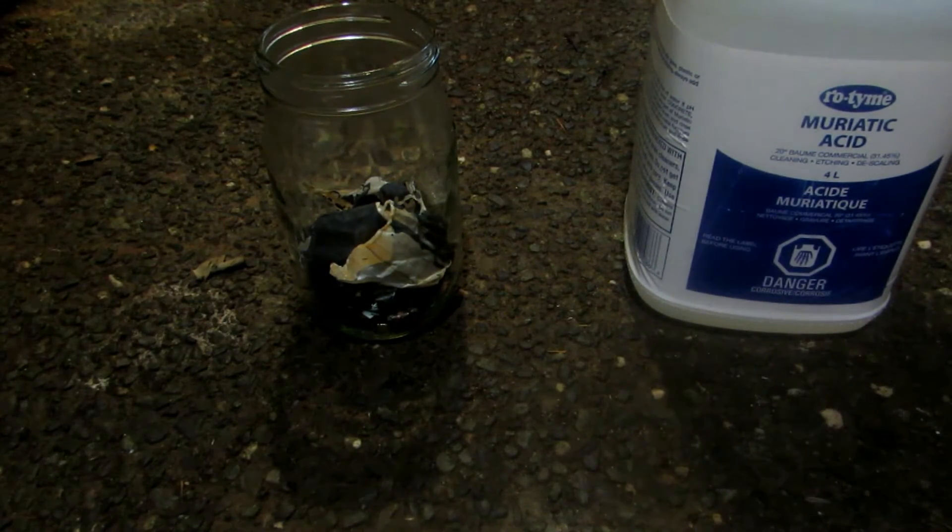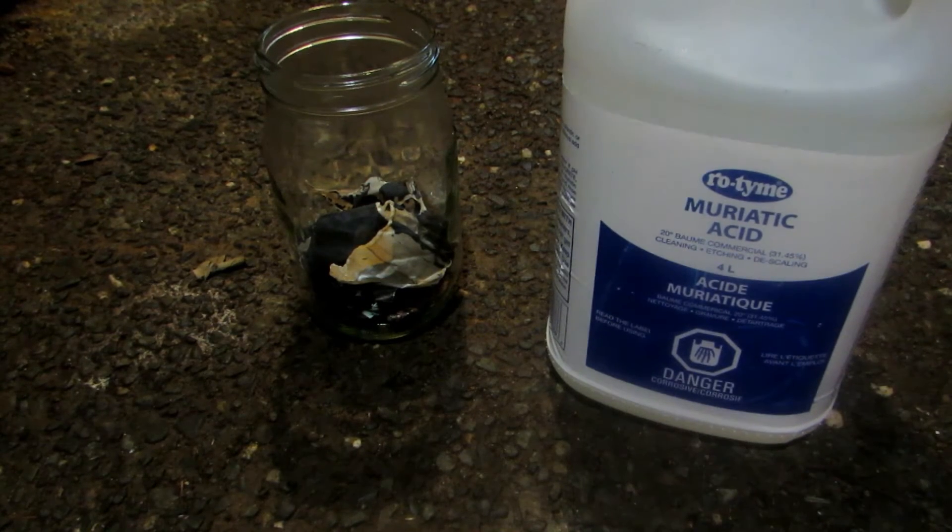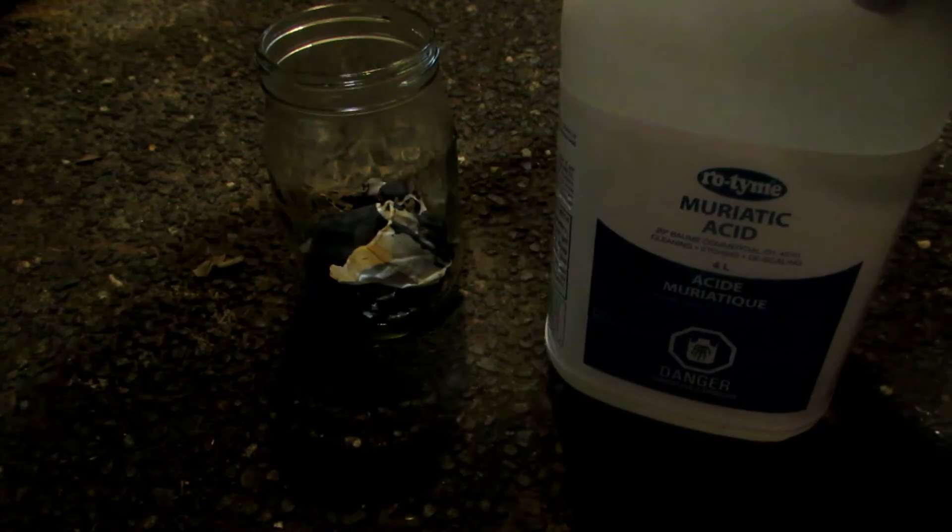After disassembly, I added everything except plastic to the vessel — though some metal was stuck to a plastic piece so I added that too to minimize waste. Next we need some hydrochloric acid, sold as muriatic acid at places like Canadian Tire. We fill it above all our material and it will begin to rapidly dissolve everything, forming lithium chloride and cobalt chloride.